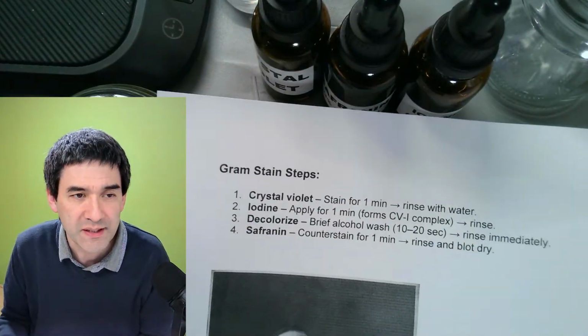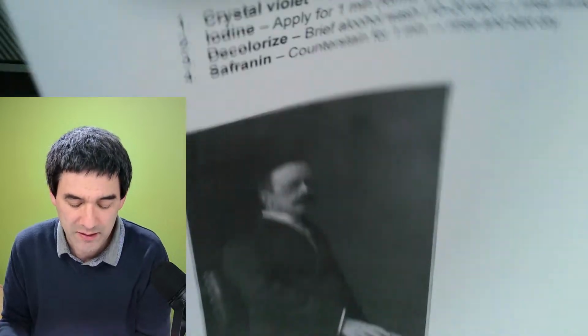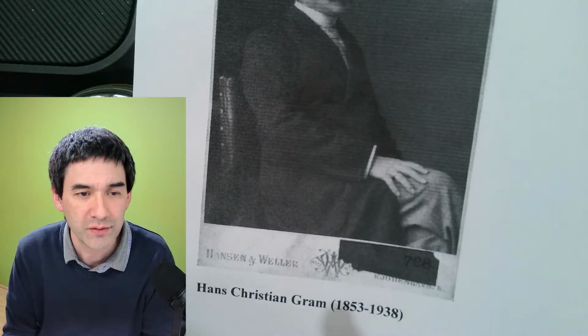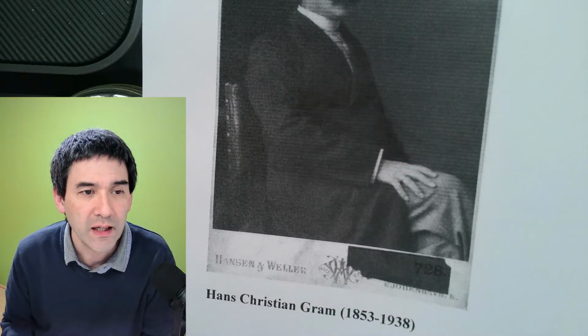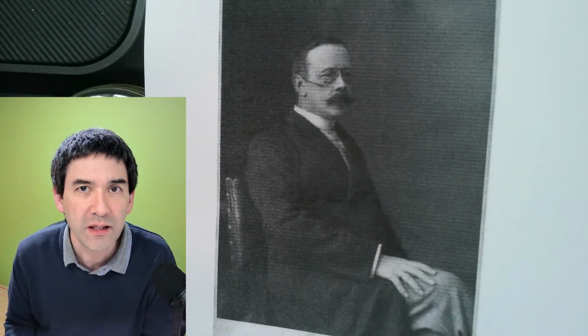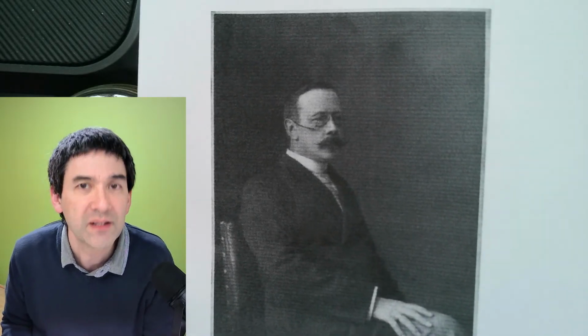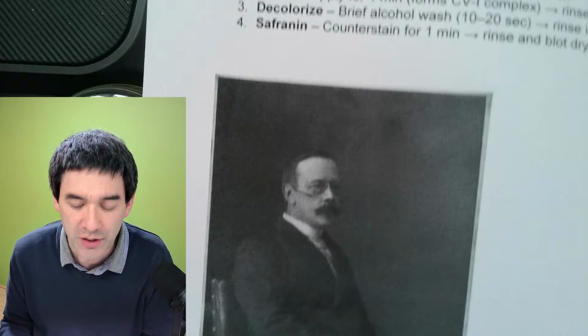So here are the steps. Basically, that's Hans Christian Gram. I got his picture here. He's from the 19th century, and he developed this technique, and it's of course not only of historical relevancy, but it's still used in bacteriology these days.